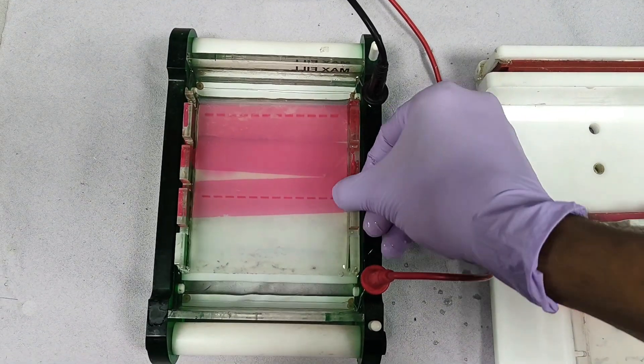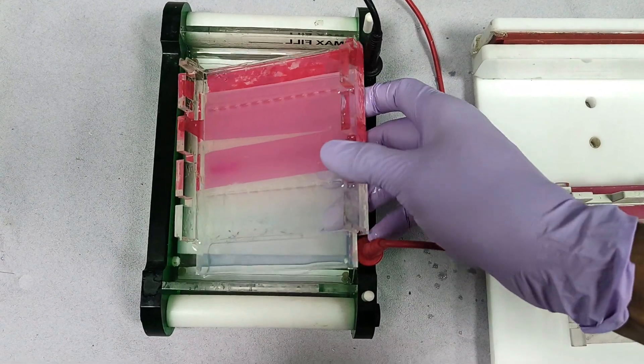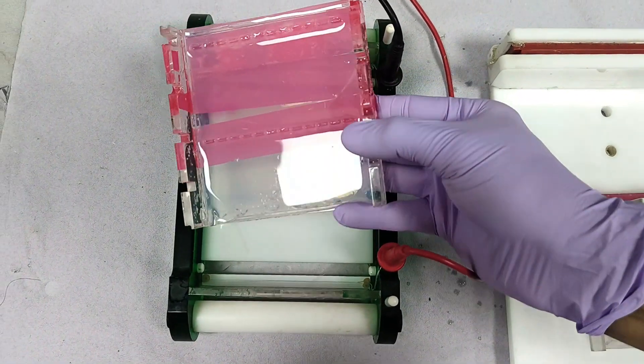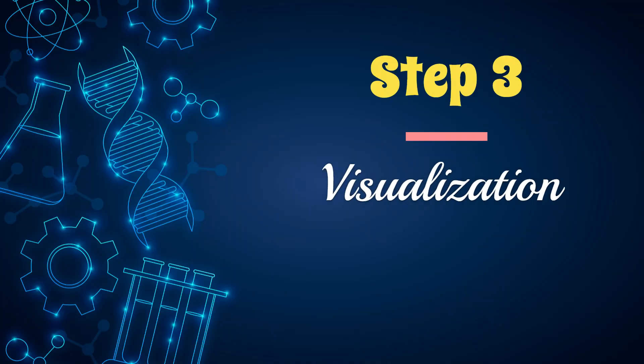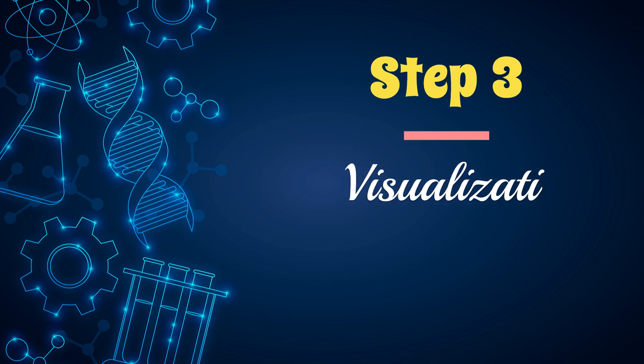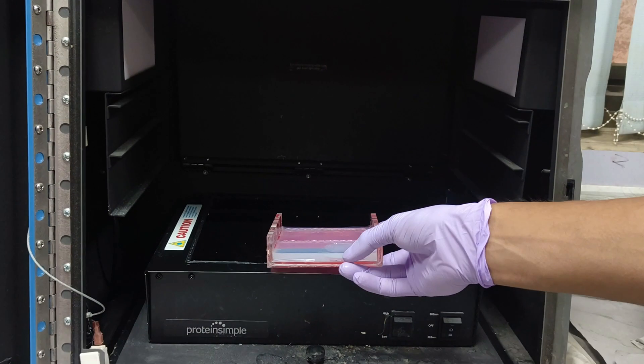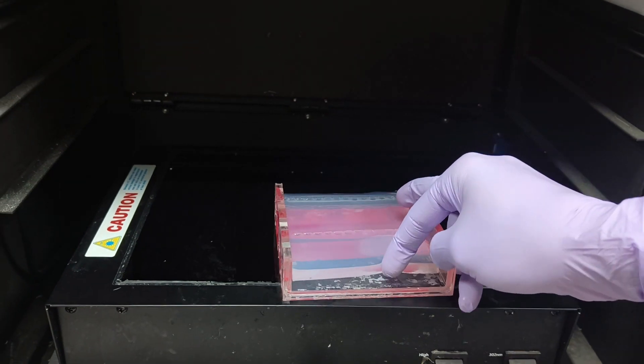After the gel run is complete, take out the gel from the tank and proceed for visualization. Let us visualize the gel in the gel documentation system. For this, place the gel inside the gel dock.